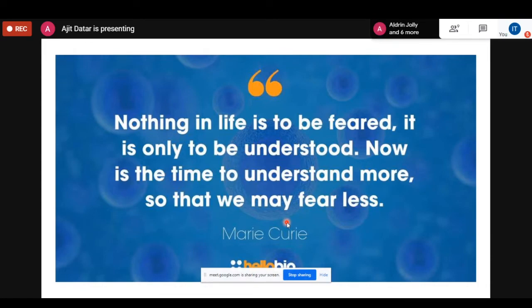So last question. Rishiraj Gupta asks whether ICP-MS can differentiate between dissolved and suspended metal in wastewater.